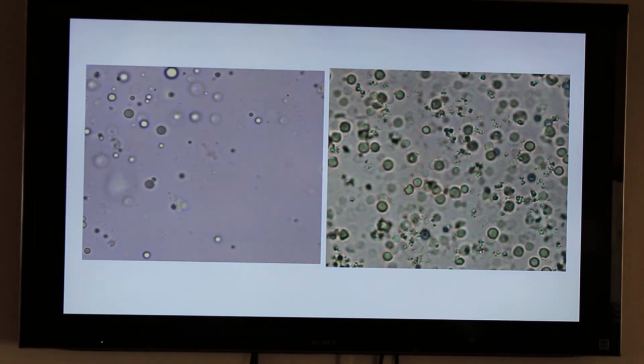The next 2 pictures are comparing red blood cells from fat droplets. So the key term in identifying a fat droplet is refractile. So these red blood cells, you can see their anatomy and a little bit of their central pallor, where you see here they're solid, and then you have these bright white where that's the area where they're refracting. When you're focusing on your microscope, maybe the other bubbles around it will refract it at different levels.